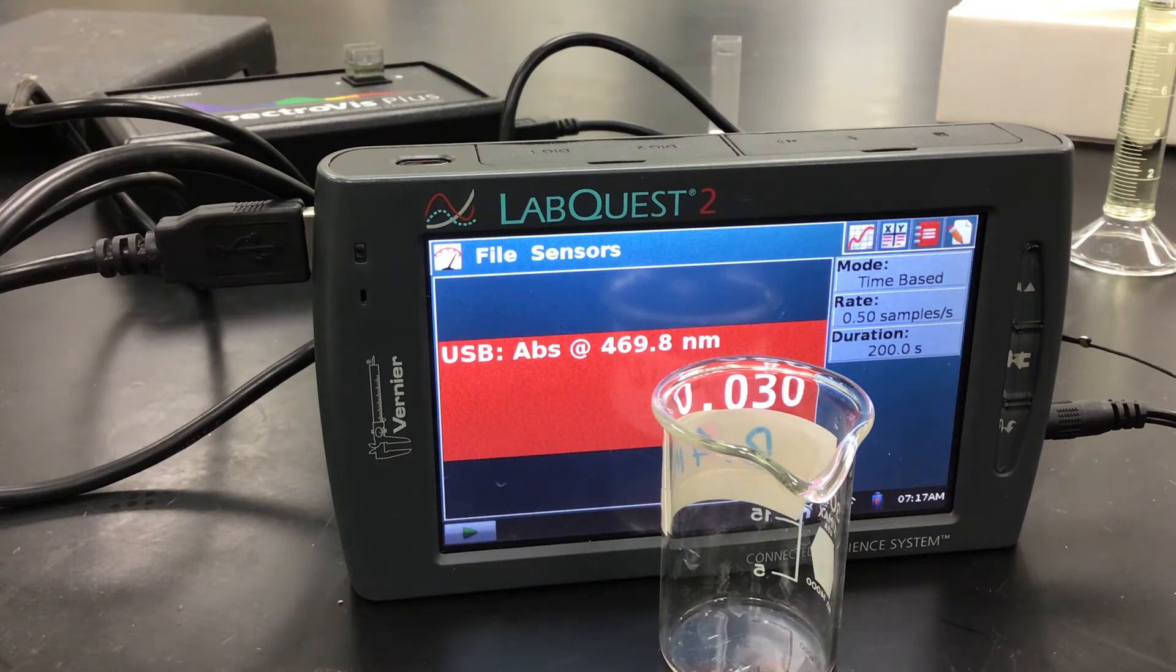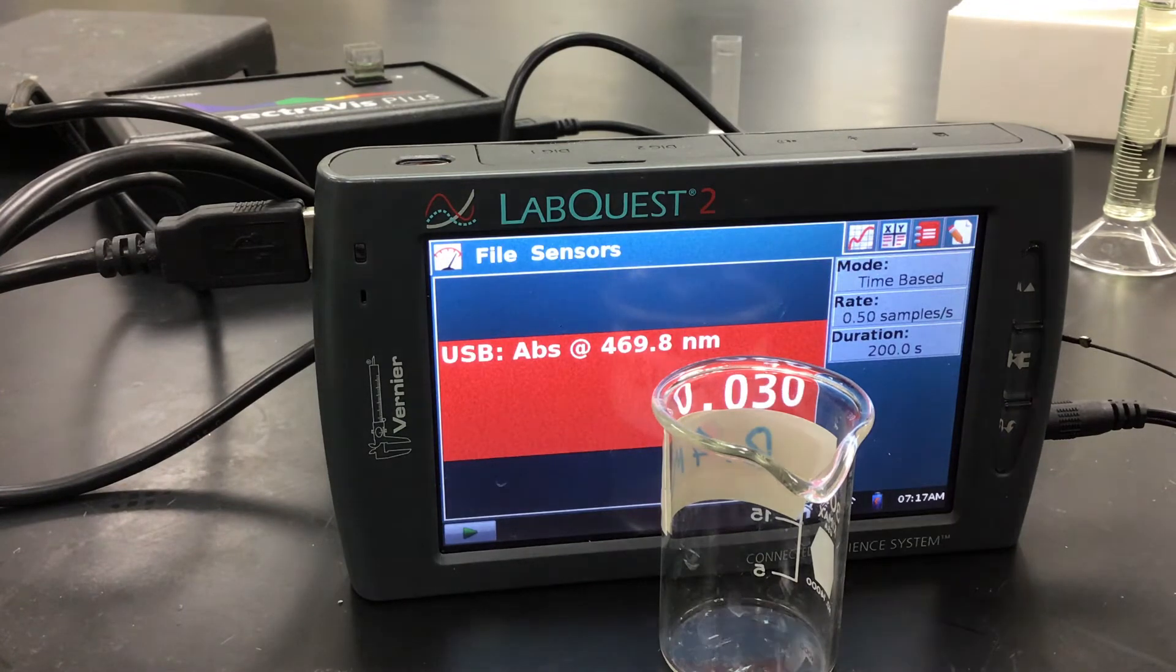So you kind of want to have everything ready. You want to have an empty cuvette. You want to have your solutions ready to mix and all of that kind of at the same time.